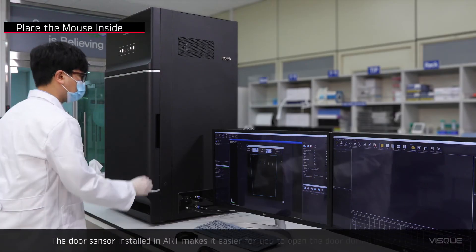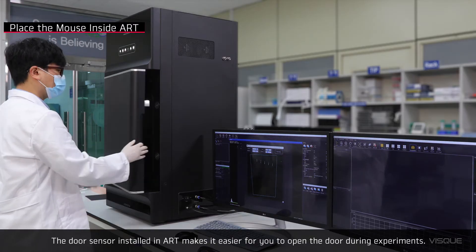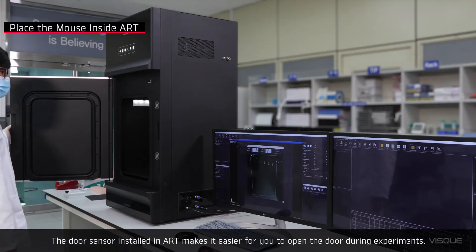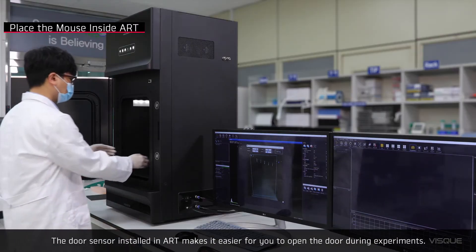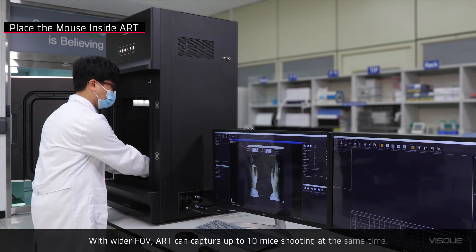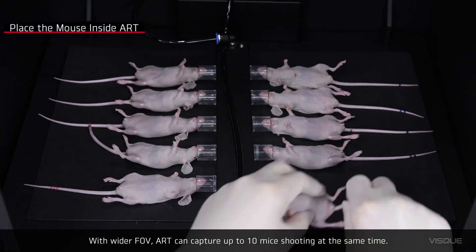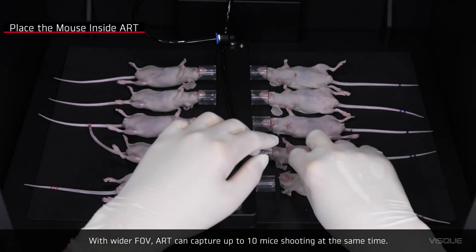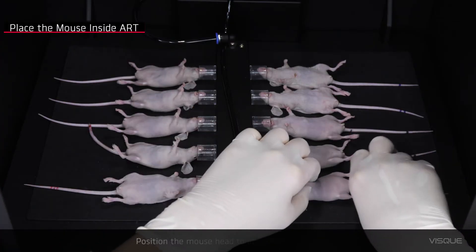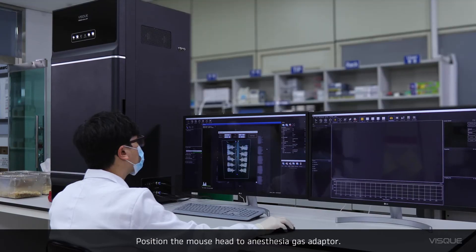The door sensor installed on the Art makes it easier for you to open a door during experiments. With wider field of view, Art can capture up to 10 mice at the same time. Position the mouse head to the anesthesia gas adapter.